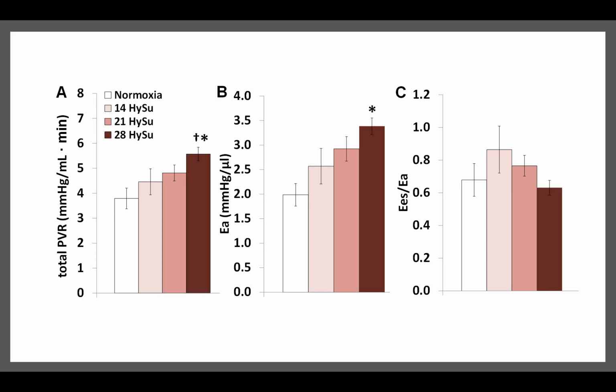and this is probably most illustrative to us about when these hearts are going to start to fail. So again, we have some improvement in this ventricular vascular coupling after 14 days, and then it slowly starts to drop after 21 and 28 days. And so all these measures combined really help to tell us where the difference between adaptation and maladaptation occur. Next slide.